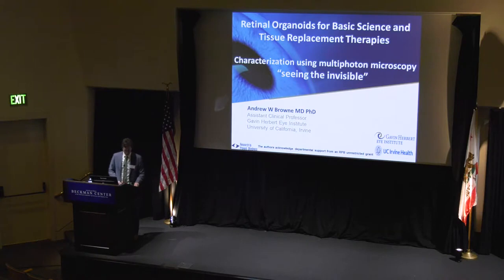And so what I'm going to talk to you about today are retinal organoids. I'll describe what those are and what their relevance is in basic science, in tissue replacement therapies, as well as methods to characterize retinal organoids using multiphoton microscopy. The idea here is seeing the invisible.